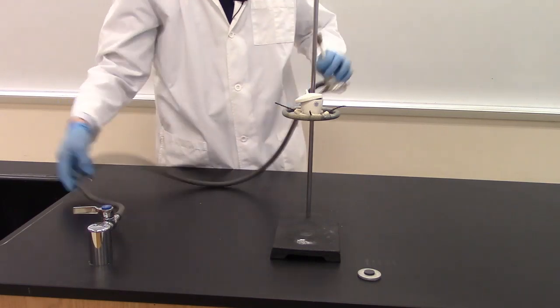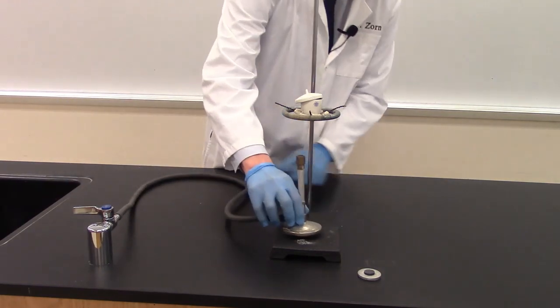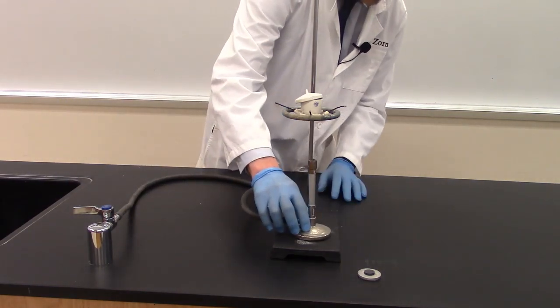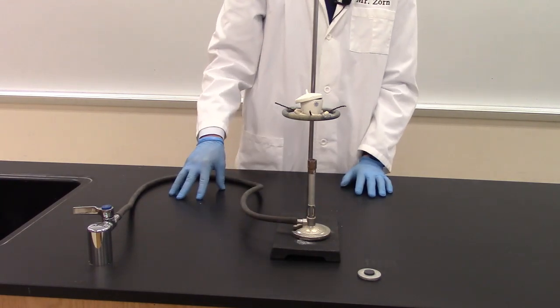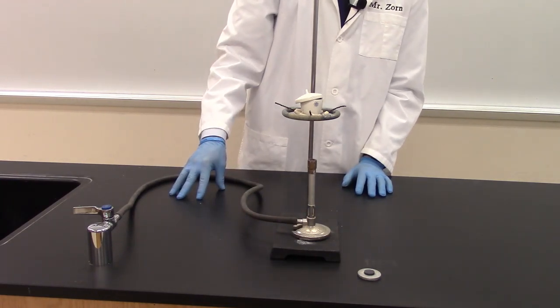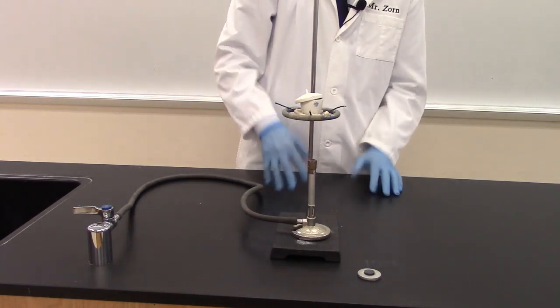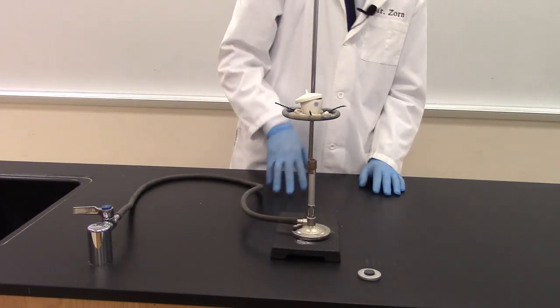Alright, our next step is to take our Bunsen burner and we're going to place this underneath. Okay, you want to have this about two or three inches away from the crucible so that it's not directly in the flame and it's not too far away. So about two or three inches is a sweet spot.